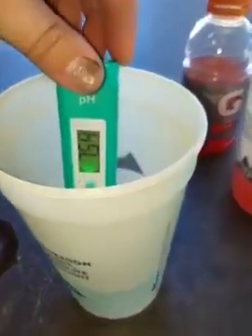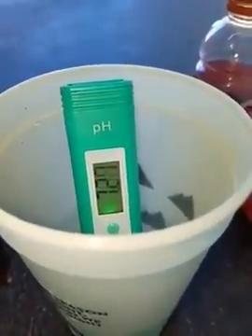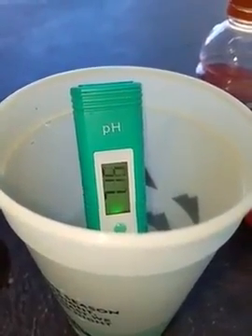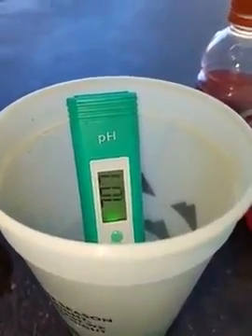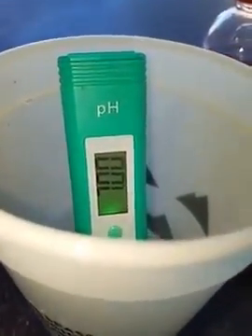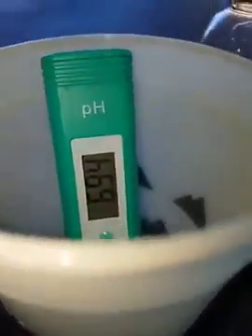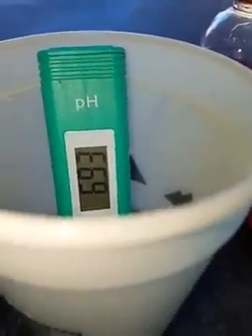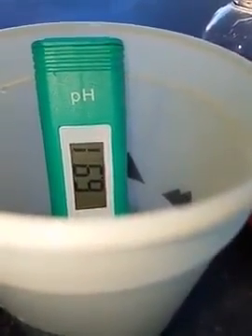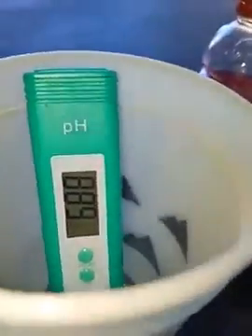I have a cup of my hot tub water. So I'm going to go ahead and stick that in there and turn it on. And this should be a lot higher because of the chlorine content in it. So we shall see. So we're at, no, it's going down. Maybe I need more chlorine. Yeah, I think I need more chlorine. I gotta check my pH levels on this. But as you can see, the numbers just keep going, and you just want to wait till that number becomes stable to really get a true pH reading.